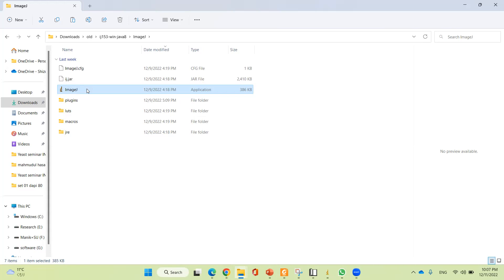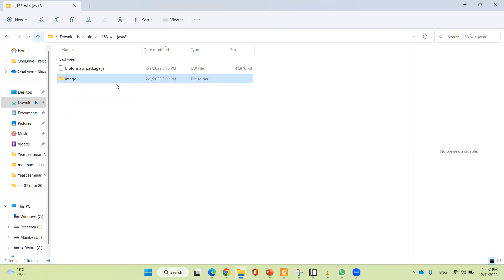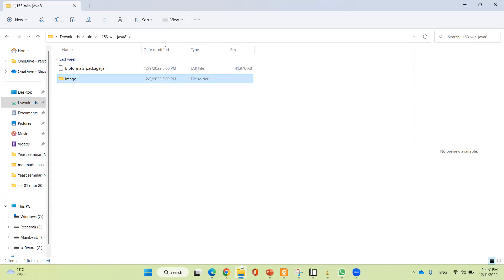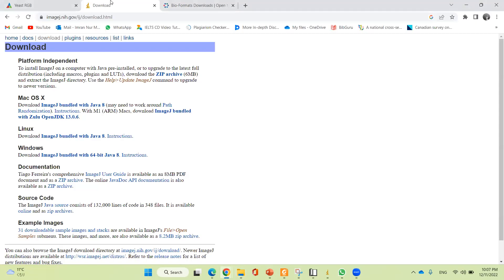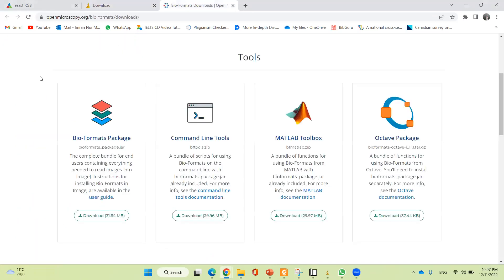Before using ImageJ, we will require a plugin. The name of this plugin is BioFormat Packages. The BioFormat Packages are available from the plugin site, and I will show you the site from where you can download them.